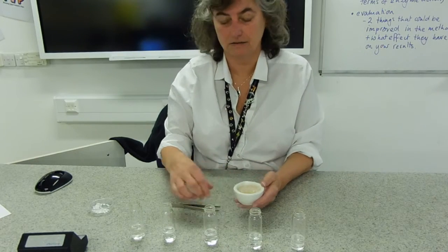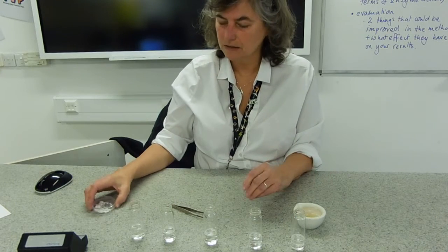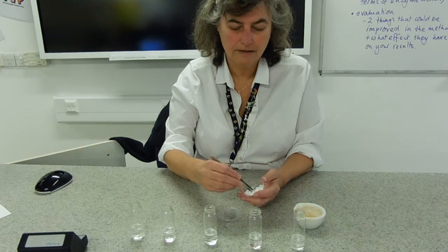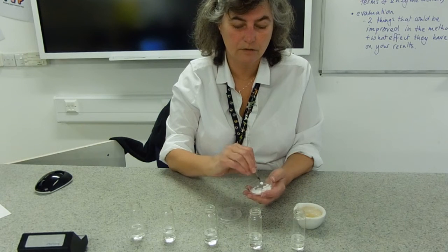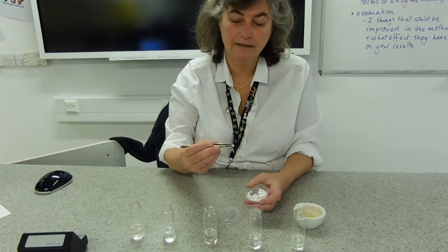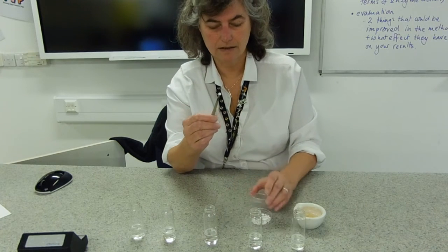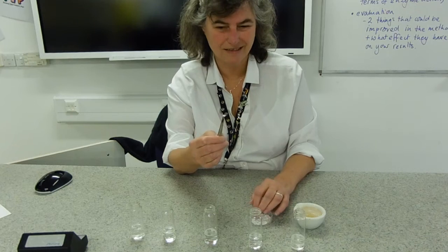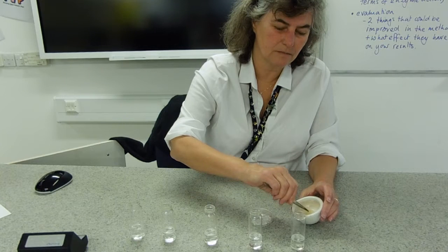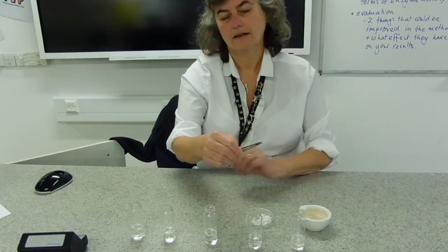You could then dilute the stock solution to 80%, 60%, 40%, 20% if you chose to do so. The principle of the experiment is that we're going to put the enzyme solution — the catalase, which is a ubiquitous enzyme (look it up in a dictionary if you don't know what that means) — onto a chad, which is the technical term for these little discs. The discs are all the same size; they've been made with a hole punch, which is why we call them chads.